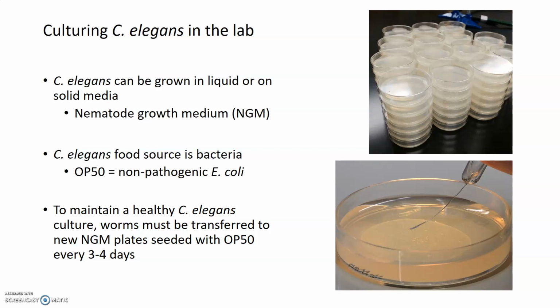And I'm going to teach you how to make these plates, grow up this bacteria, and put it onto your NGM plates so that you have a source of food for the worms, and also how to transfer them from plate to plate using a pick like this.